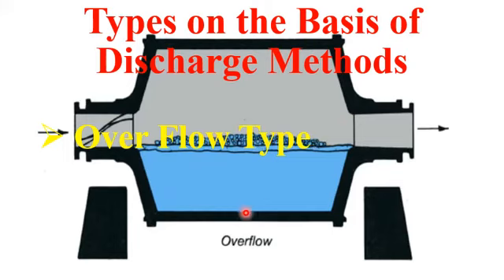So when the precursor material or the bulk material is crushed inside the chamber of the ball mill machine, they are discharged through a hollow shaft. The second type of discharge ball mill apparatus is known as a grid type ball mill discharge machine or apparatus.